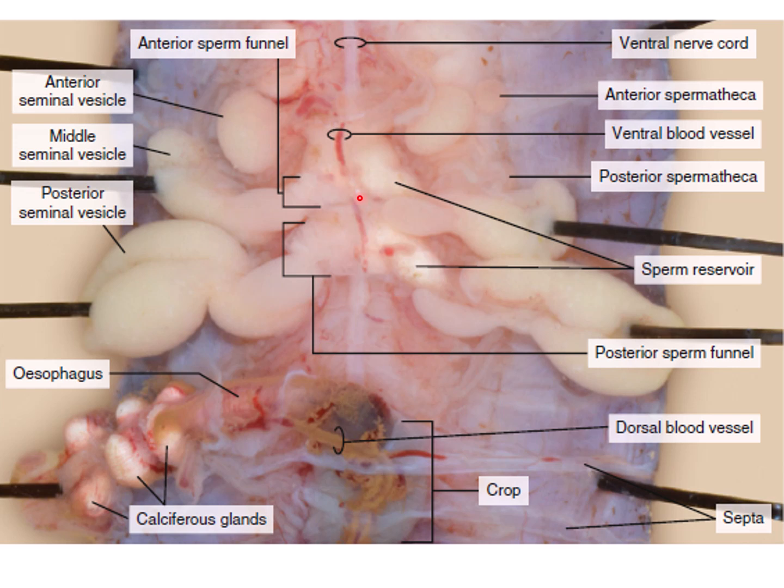And then there are two pairs of testes that are present on the ventral part of the seminal vesicles in the sperm reservoir. We can see them. And sperm funnels collect mature spermatozoa from the seminal vesicles, and then transfer them to the efferent ducts.